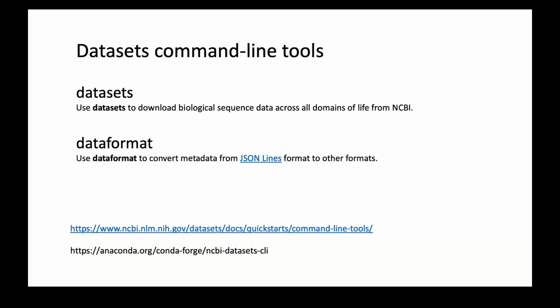So you can also download gene data by RefSeq accession.versions. Good point. But yeah, the question came in while we were looking at viruses, and so in terms of the virus genomic RefSeq accession, there's not a way to access that data. If that's useful, we'd like to know.